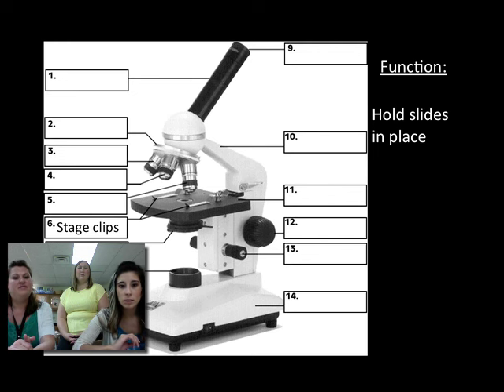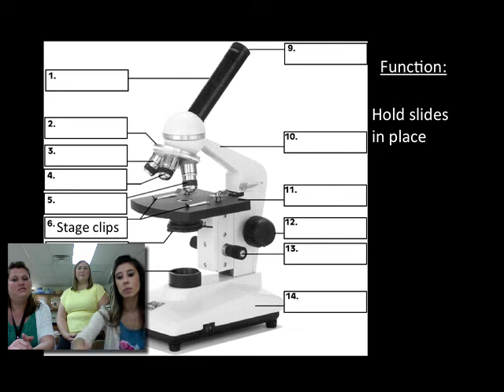These are stage clips, number six. That's where you put the microscope slide underneath. Its job is to hold the slide in place so it's not sliding around or dropping on the table.